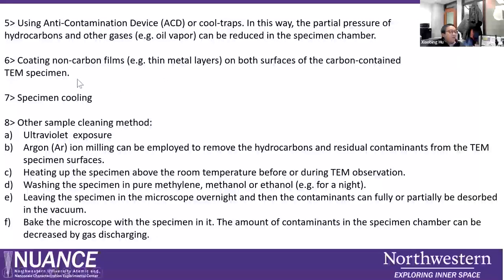Another thing you can do is coating. You can coat some non-carbon film, like a very thin metal, on the surface of your sample. But this way usually only works for low-mag imaging. Because if you go to atomic-resolution imaging, if you deposit, for example, nickel or some other metal layer on your sample, of course maybe there is no contamination, but the additional metal layer will reduce the quality of your image.